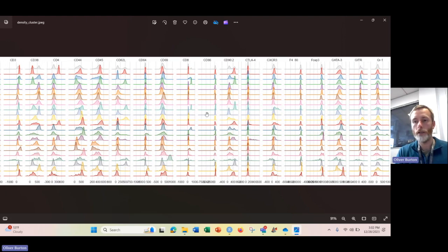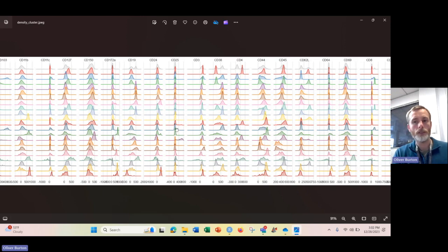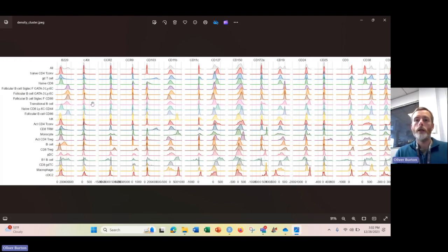So that's what the script has done for this. It's tried to identify the clusters that have been generated based off of the markers that it expressed. And it's not perfect, particularly when you get to very rare populations at the bottom. When Phenograph does some over-clustering, you'll have noisy clusters, and the identification won't work because basically we're looking at junk. So it will assign a name, and that won't be accurate. For today, we're just going to say that these are good.